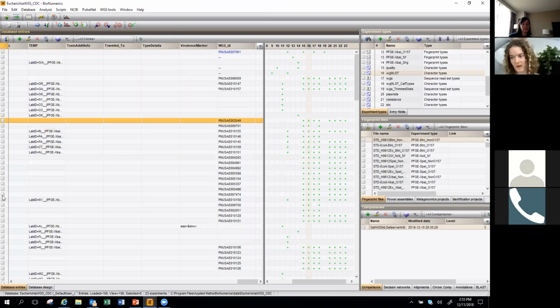How far can we go in BioNumerics for those species that had a star by them in the ANI PowerPoint slide? So there you can identify them in ANI. I would not import them into your organism-specific database because once you run allele calls on those, you're going to maybe not get any or just very few for a lot of those species. So if you're pulling it in there to look at the WGMLST results, you're not going to have good results. If you want to pull it in there to do a SNP analysis, then you can do that.